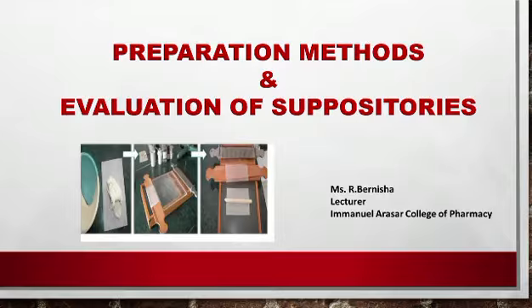Today we are going to see the preparation methods and evaluation of suppositories. In the last video, we learned what suppositories are, their advantages and disadvantages, along with the suppository bases used in their preparation. Today in this video, we are going to learn in detail about the preparation methods: the different types of methods used in the formulation of suppositories, and the methods mainly used for their evaluation.